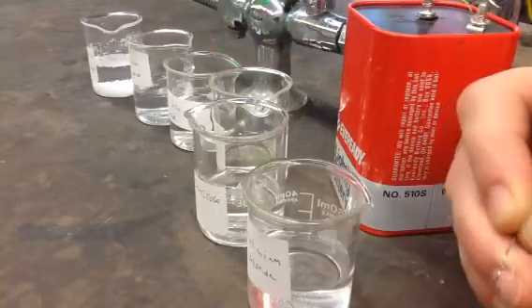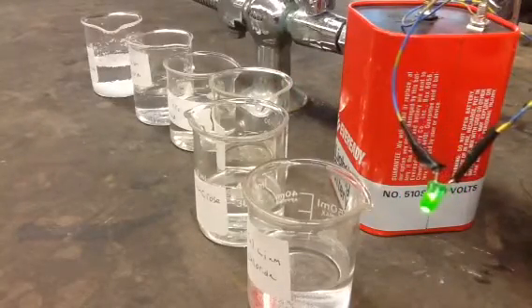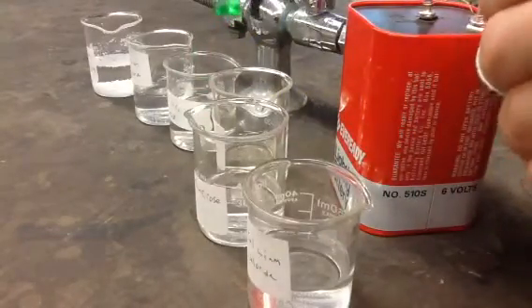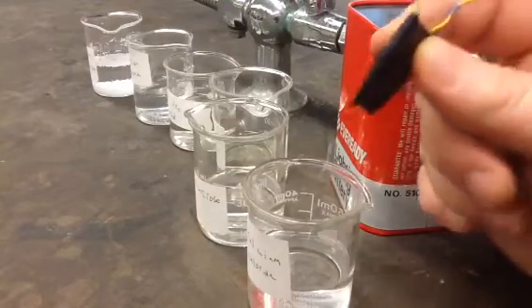So if I just connect those two wires down here and close the circuit, hey, what do you know? It lights up. And I can unconnect them. So we've got our very sophisticated testing apparatus, as I mentioned. And the first solution we have is calcium chloride.